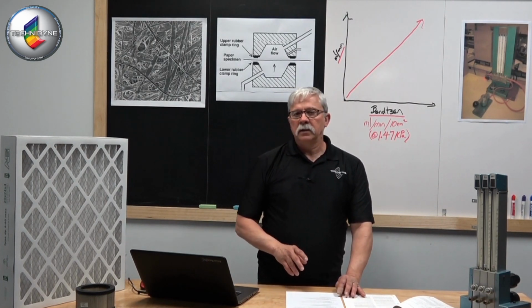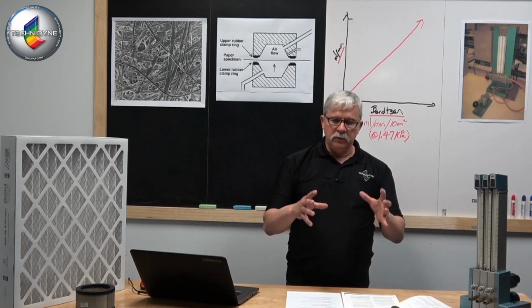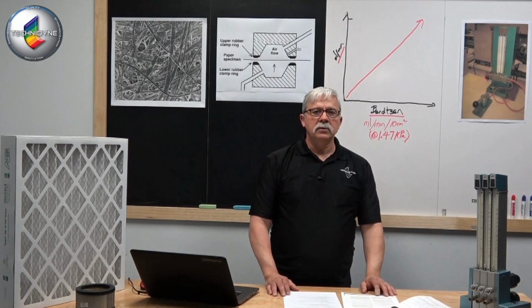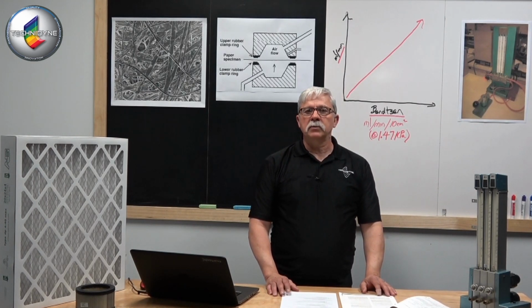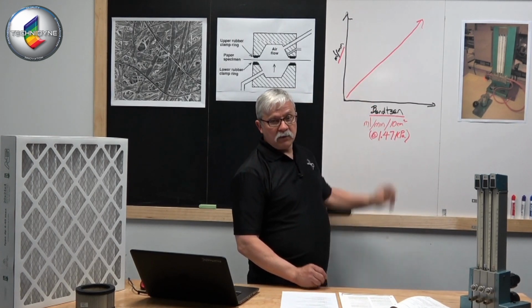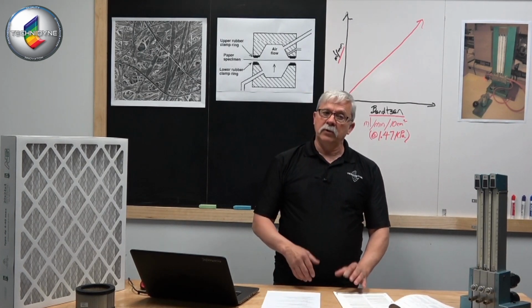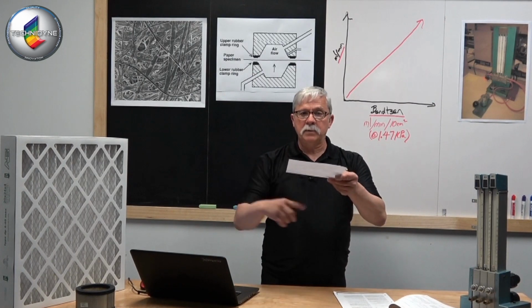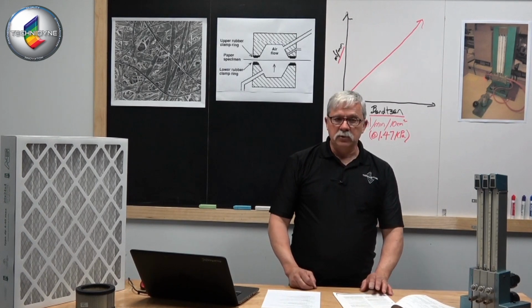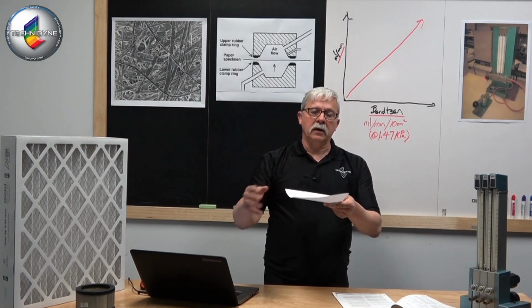Now, the Bendtsen folks had some foresight in understanding that this configuration wouldn't meet all sample grades. As you started getting into tighter grades with much lower flows, the accuracy of your measurement decreased. So they increased the pressure differential top to bottom, from 1.47 to roughly 2.2 kilopascals, so that if I've got a tighter sheet, I can still force air through and get a reasonable number.